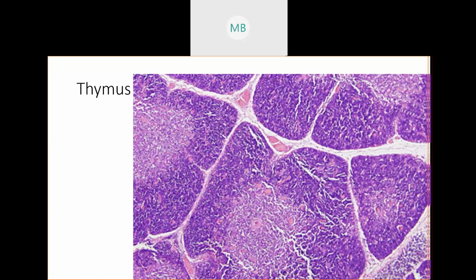We have terms that describe the meatier outer bits and the lighter or stringier inside middle. The lighter middle is always going to be called the medulla. Whenever we have to deal with this, be it kidneys, lymph nodes, adrenal glands, or this microscope slide of your thymus when we're describing the lobules, the middle, lighter part is always going to be the medulla. The meatier, denser outer part is always called the cortex. So know the words cortex and medulla.